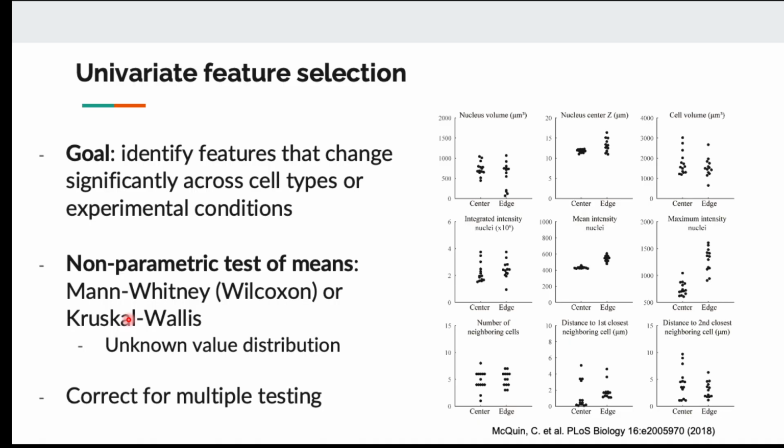You can do a lot of univariate analysis, and you will get to see which ones show statistically significant differences across images from different conditions or diseases.